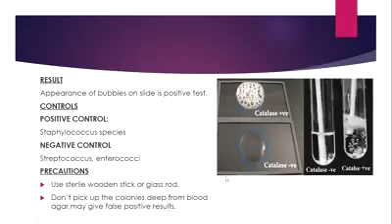And this shows the slide method, the positive test as shown by the bubble formations, and the catalase negative, there is no bubble formation in this. While in tube method, again you can see that the bubble formation shows the catalase positive, while no bubble formation shows catalase negative. We need to take some precautions performing these practicals.